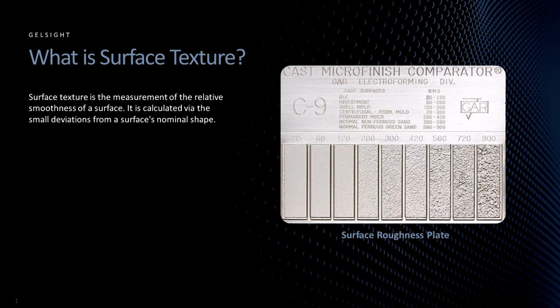Looking at this surface plate, you can see that it is critical to determine the desired surface roughness of a part before the manufacturing process begins. The surface texture can influence how a manufactured component will interact with its environment. That can be the mechanical friction of one part with another, or simply the visual impact it has on you while looking at the surface.